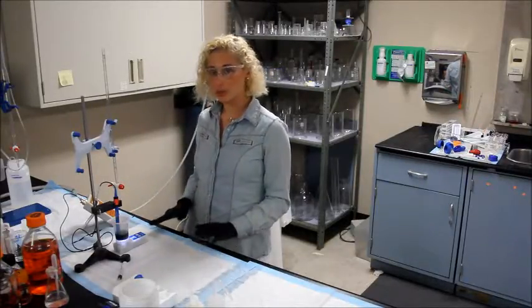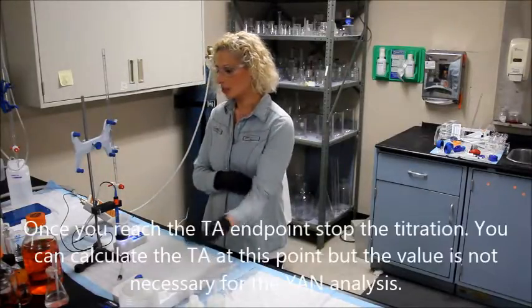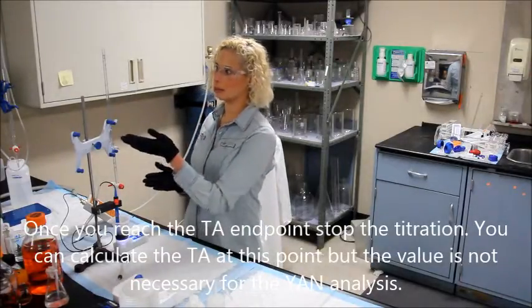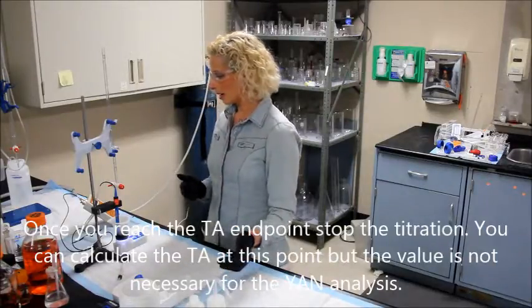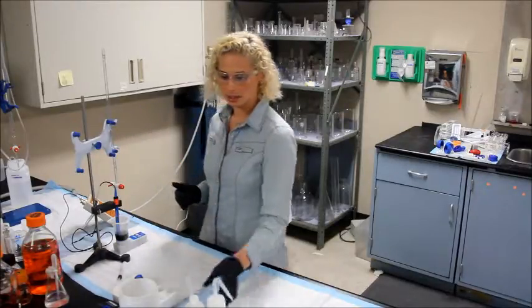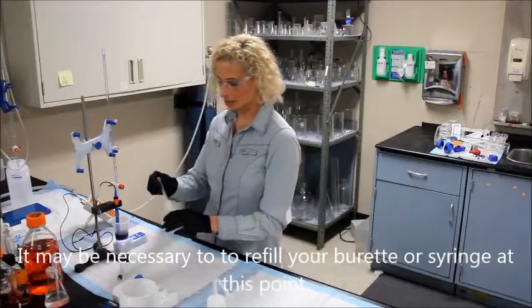I've reached 8.2, so this is the end point for the TA titration. If you want to find TA, subtract your final end point from the initial — I'm not going to do that today. I am going to add more TA titrant to my burette just so I have enough.